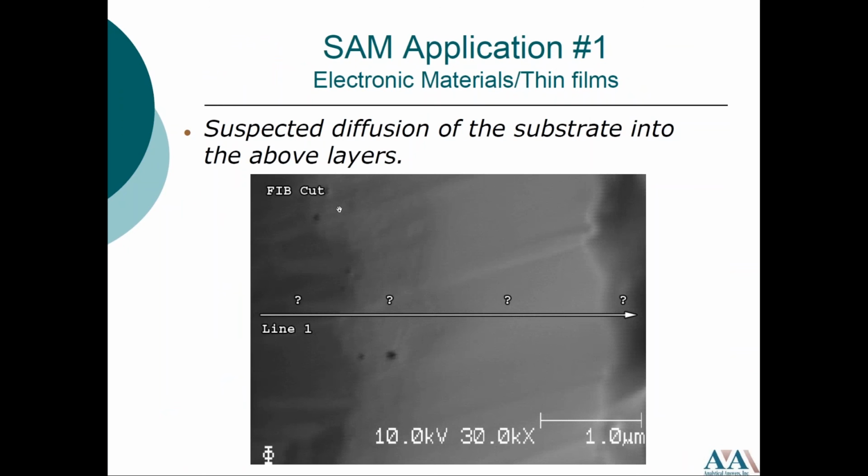Okay, we have another question. Detection of polymer residue on metal wire after laser ablation, submicron thickness. Does it belong here or in your next polymer webinar? It could actually be both. Sometimes ESCA and FTIR are used to analyze this type of polymer residue. With submicron thicknesses, ESCA may be ideal to understand what's going on there, but FTIR may give a better distinction as to what type of organic residue is on the surface.